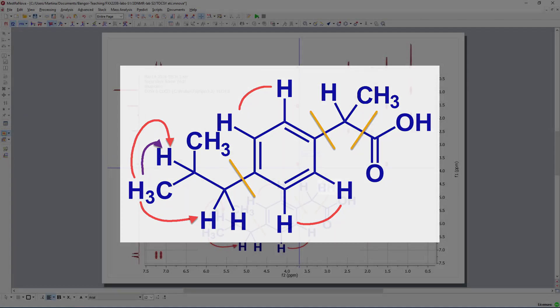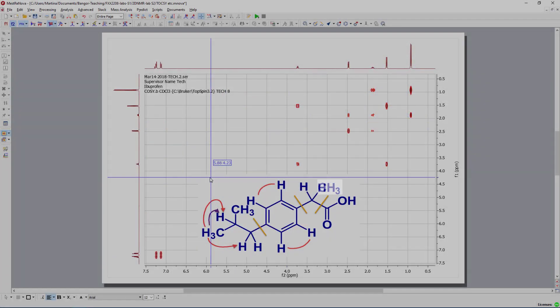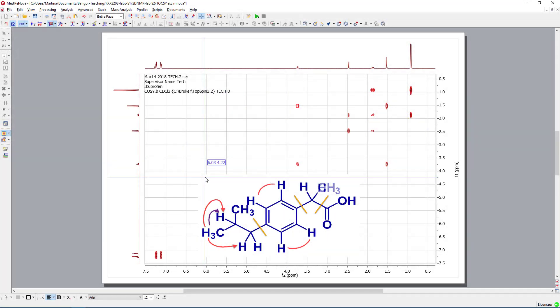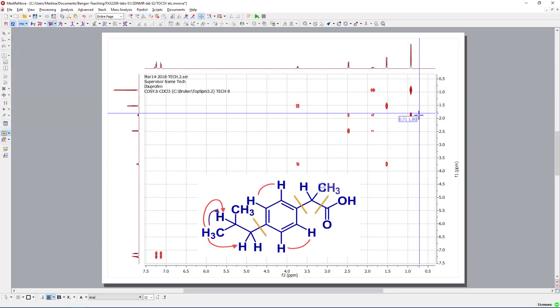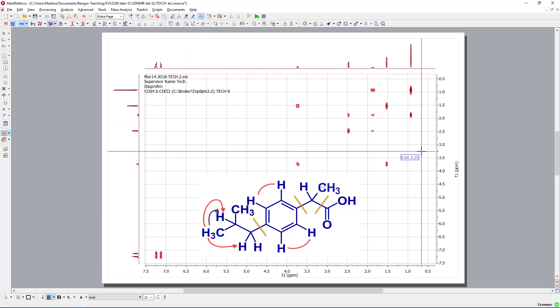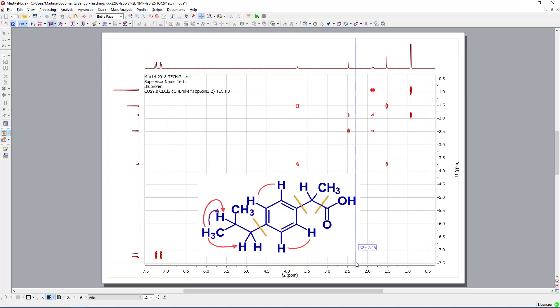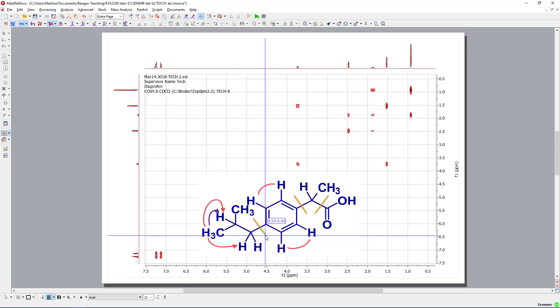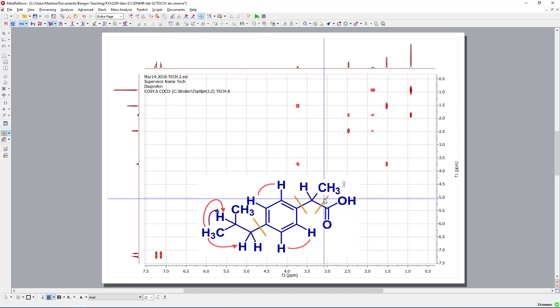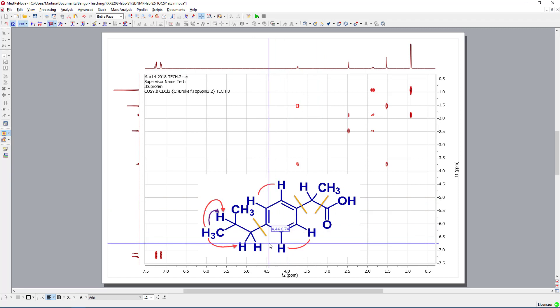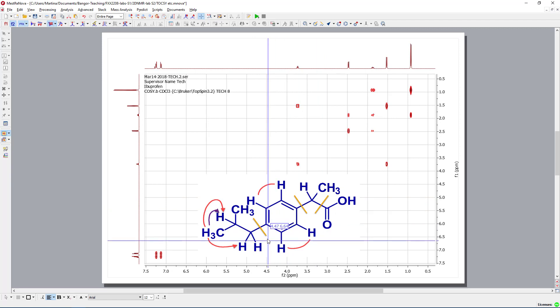We have one spin system on the ethyl side and the other side that's just the methyl group. So, there is no additional interaction. So, we have two independent spin systems. Okay, let's go back to our ibuprofen.